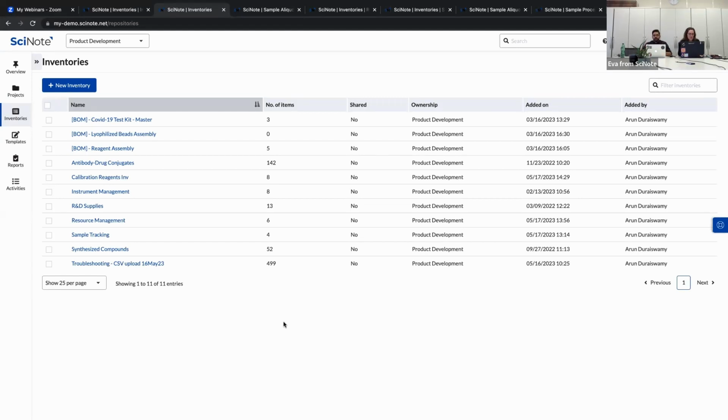Now, because I don't have the feature to show you, this is the best explanation I can come up with verbally, but if you have additional questions, please email me directly or email your CSM, and I can explain it to you in further detail or answer more specific questions regarding the parent-child relationship.